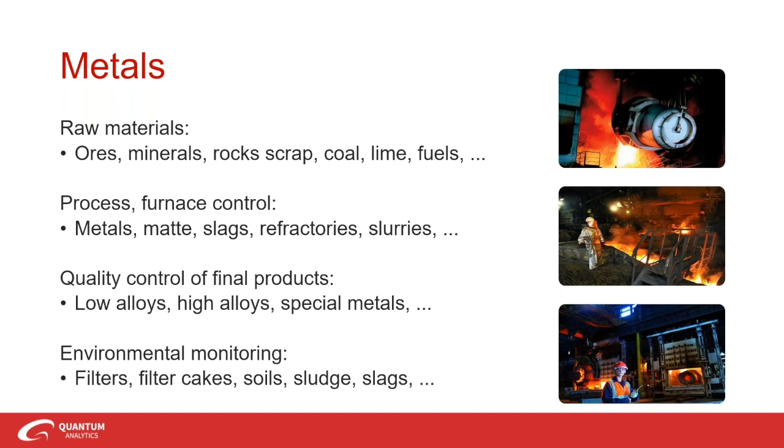Special alloys are made by adding expensive elements to steel. XRF is a superior technique that can measure high concentrations of these alloying elements directly in the solid metal. This allows for large cost savings by preventing overuse of the expensive alloying agents.